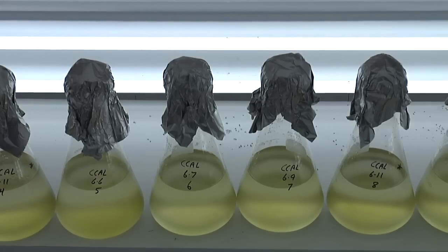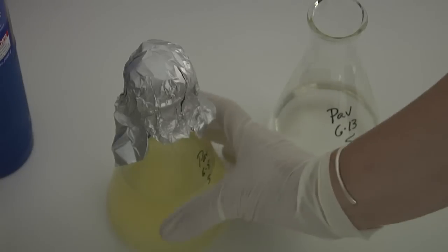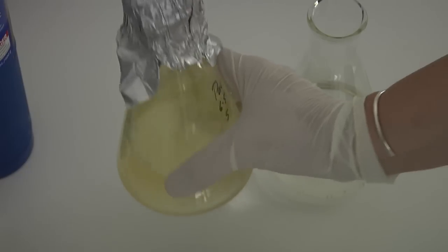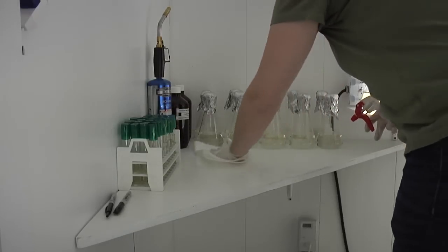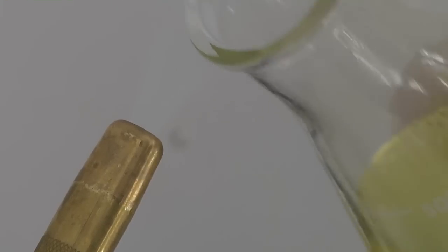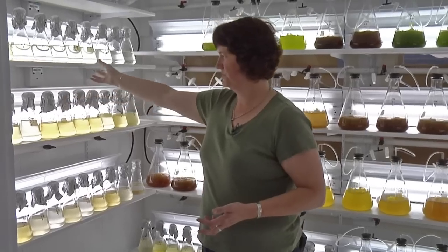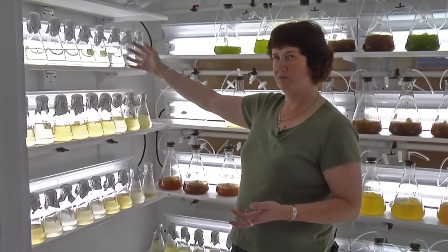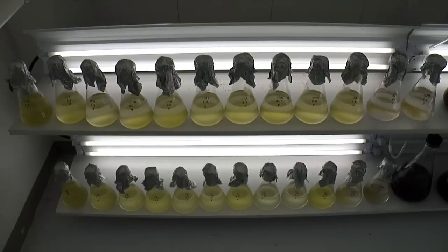These flasks are covered with this kind of top that is then covered with tin foil. Inside of there is some sterilized cotton. All of the samples in here, all of the growth medium are autoclaved because we want to keep our samples sterile. If they're not sterile, then we have to discard them and start a new sample. The cotton inside allows air flow in, but it will filter out any kind of bacteria that's going to try to colonize the flask.